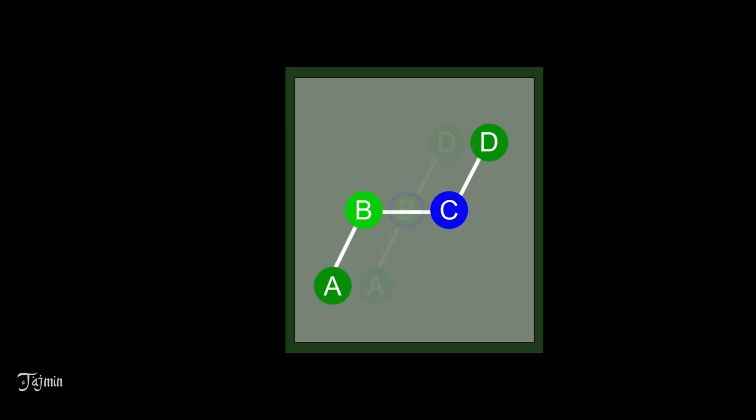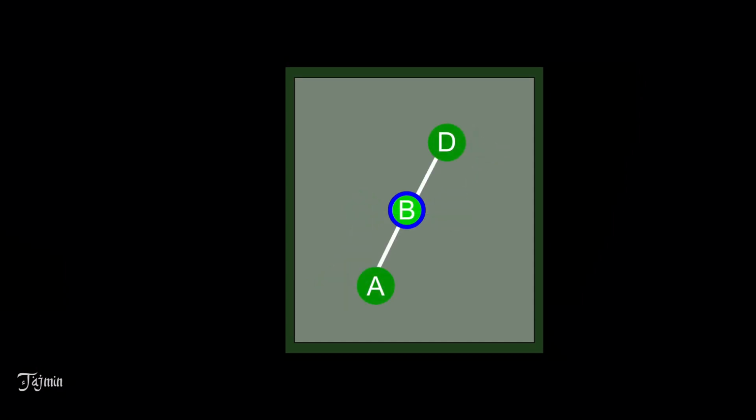Now look through the bond BC by keeping atom B towards yourself. Here, bond AB is the nearest one and the bond CD is the farthest one. And finally, measure the angle of rotation around the bond BC via AB to CD.